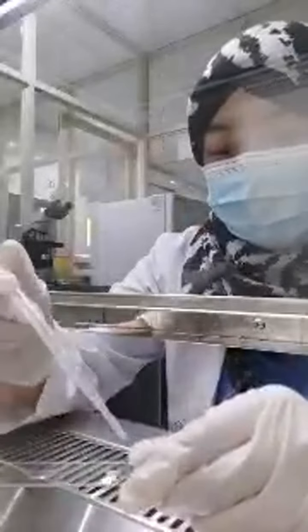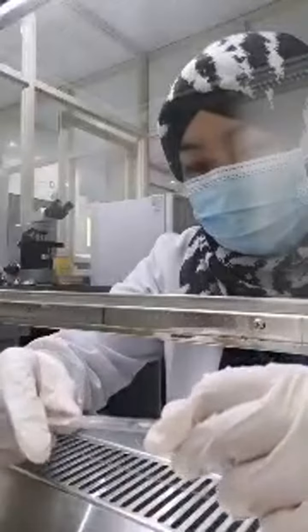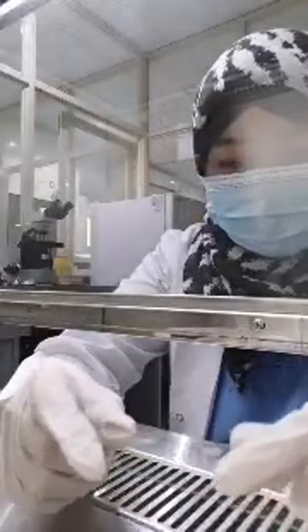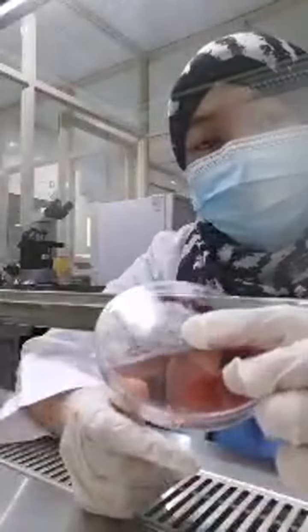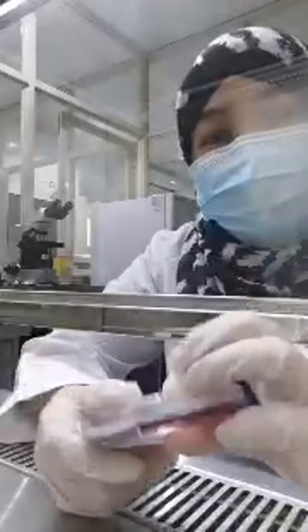Then I will put it on the slide. Then let's see if there is a bubble. Did you see it? The other one without the bubble and the other one with the bubble. The gram stain of this plate shows Staphylococcus and Candida albicans.